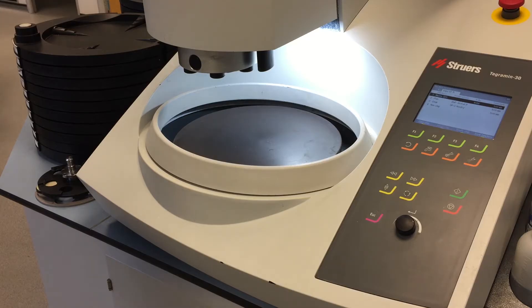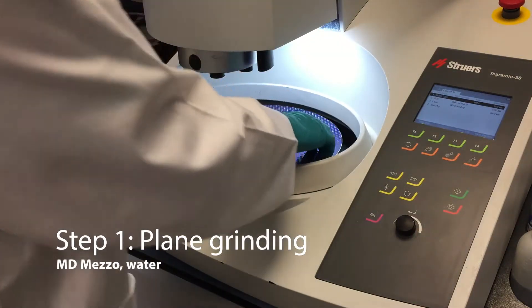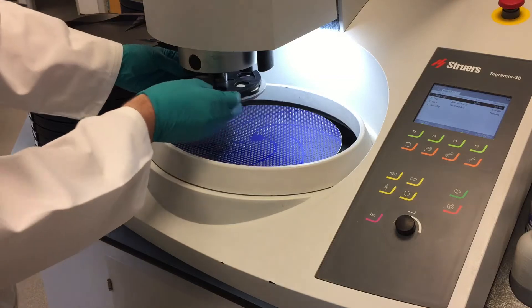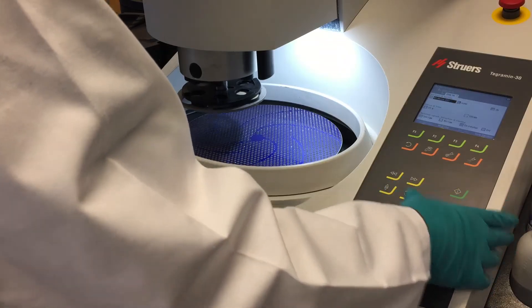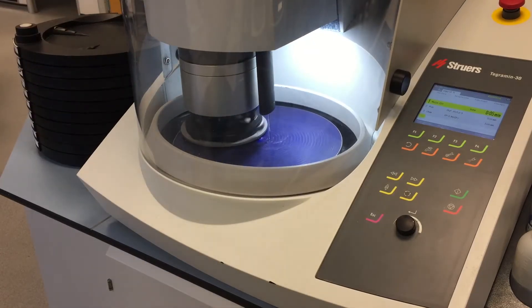As well as demonstrating the machine today we are also going to show you our 3-step titanium method. Matt's now going to load on the first disc and load up the carousel. We are going to use the sample mover plate so we have individual pressure feet that come down on each sample. After one minute on our MD diamond disc, which is specially formulated for titanium, we should get the planarity we need for the further operations.